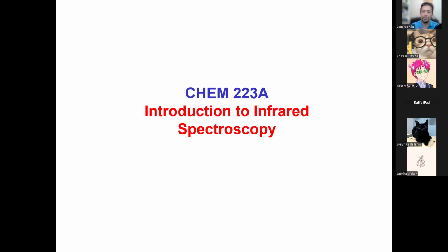So we're going to actually talk about the details. What exactly is all this? What does it mean? How are we using it to see the squiggly lines? And how can we use the spectrum, the spectra, to figure out what it is that we have?